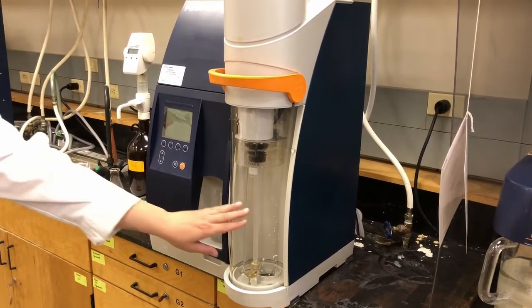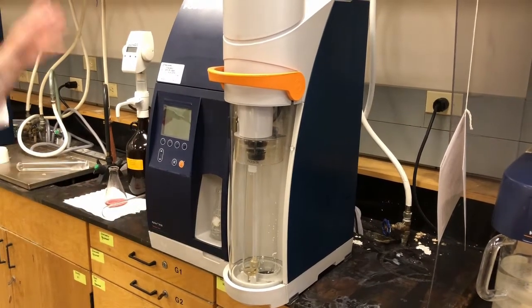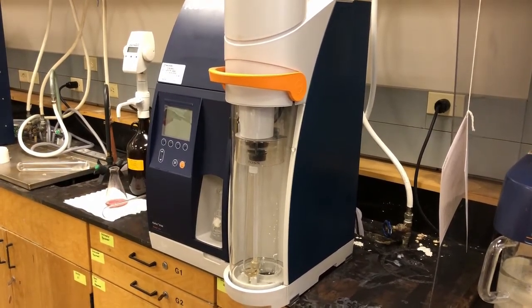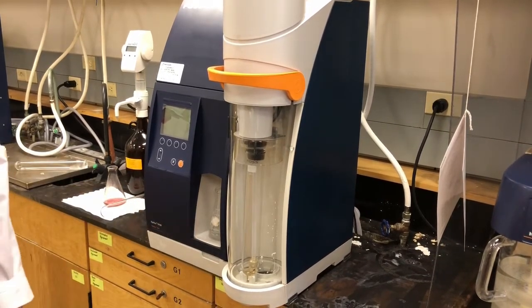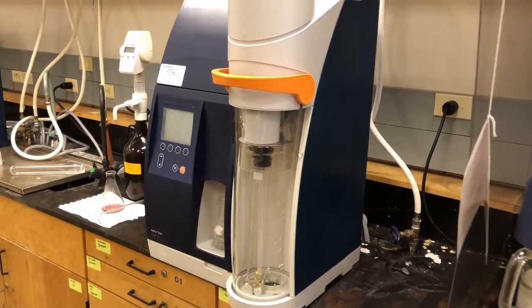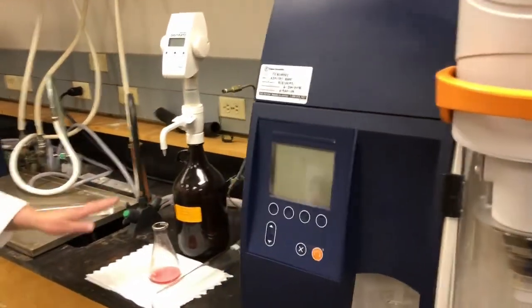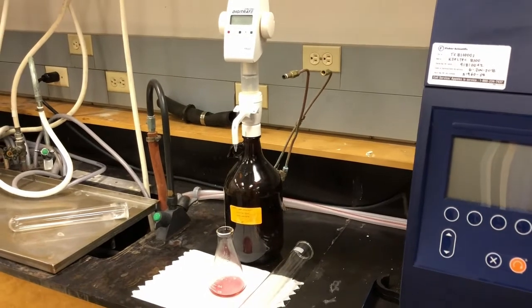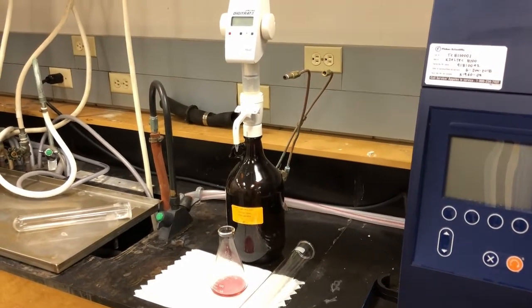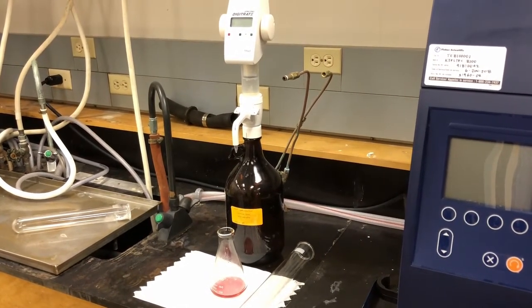So we put our sample in here. Inside this, the pieces you can't see, is a heating coil and a condenser, so the ammonia comes out into our receiving flask. And then the third and final step would be a titration, and we're going to use a digital titrator with hydrochloric acid to determine how much ammonia is in the sample.